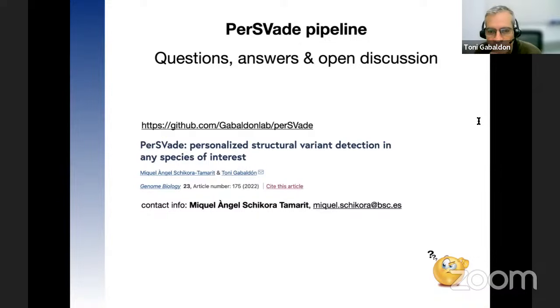Thank you. So Gabriel Mochales is asking, well, he says really interesting software. What should be the minimum coverage per sample to work with it? And are the results comparable between samples with different coverage? And he thanks in advance.